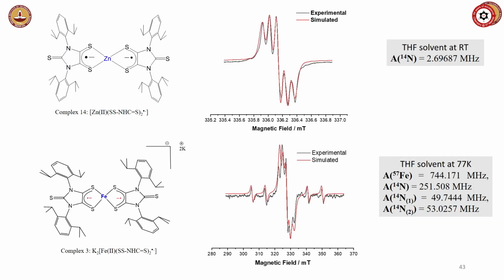And in this case you can see how these two compounds are different. These 6 lines are here, and one comes from the iron nucleus. In the zinc it is not seen because its percent is very low. Iron is a significantly higher spin active nucleus. Also iron has its own spin, so its own spin and the nucleus are all coupling, and then you get their signal also here. This is for the iron, this is the nitrogen. So EPR spectroscopy speaks about many more features.